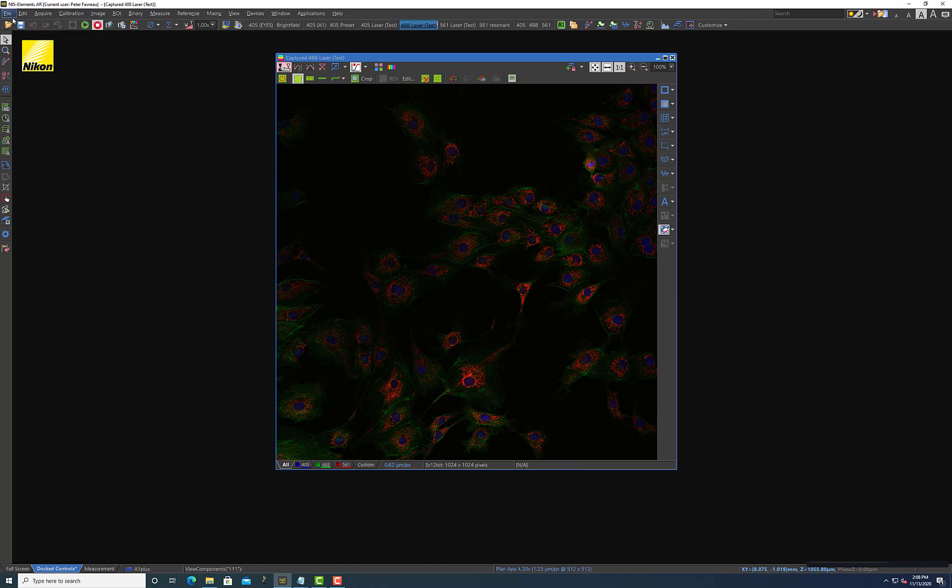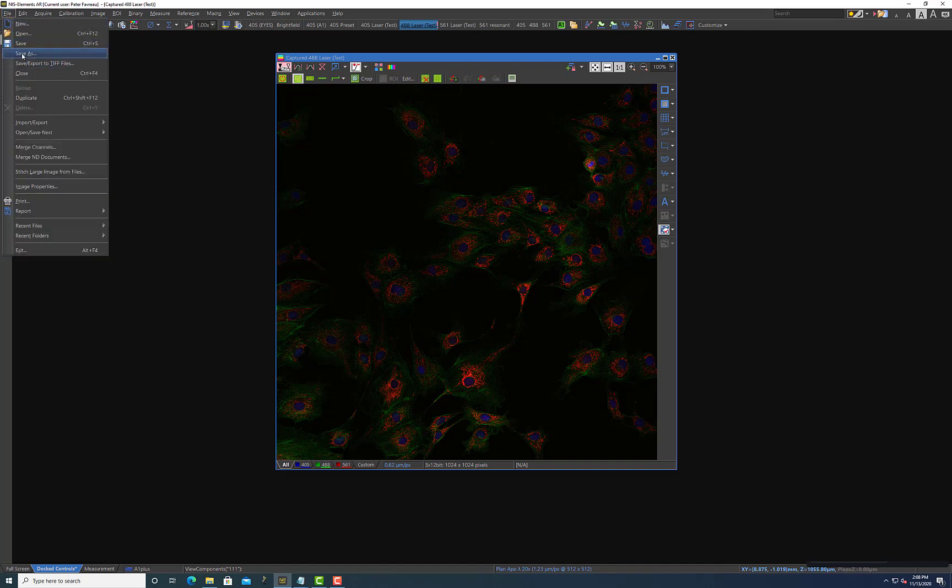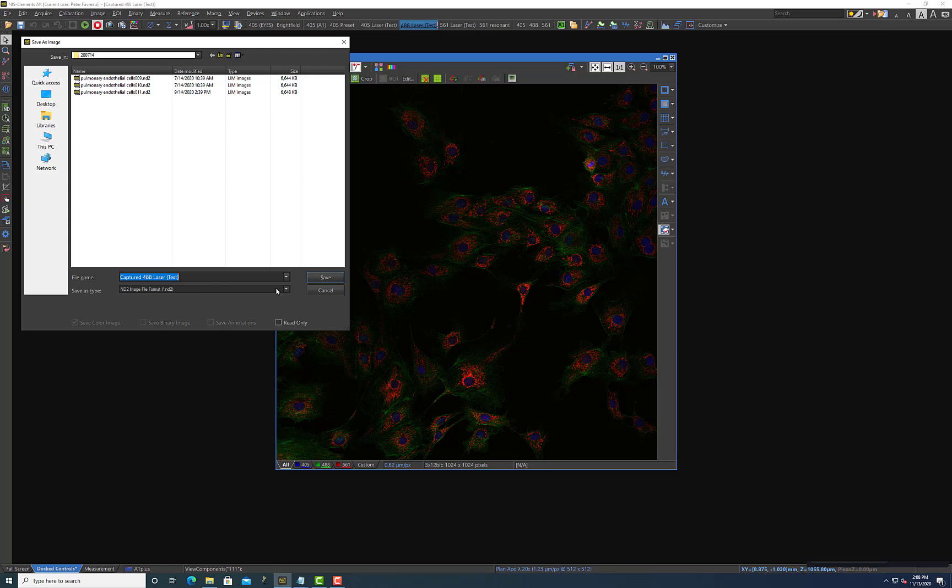So to do that there's actually many different ways of doing this but the first thing I would do is go file and then just save as. Because under the save as option is this save as type ND2 image file format which is the native elements software file format. And basically you can think of this as like a project file that if you were to open it in elements or Fiji for that matter it can also open this file, it retains all of the metadata that it acquired through elements.